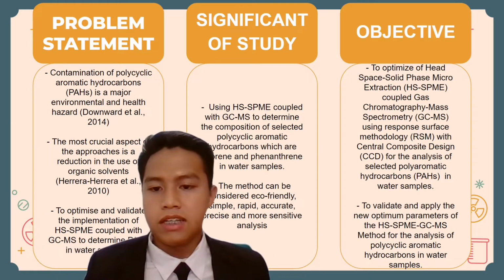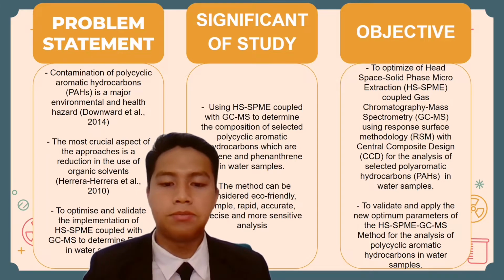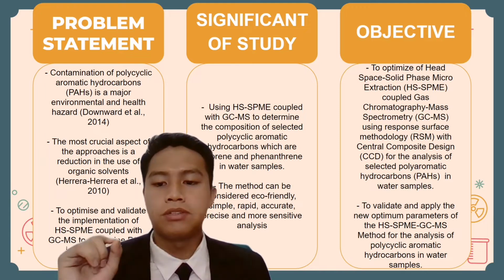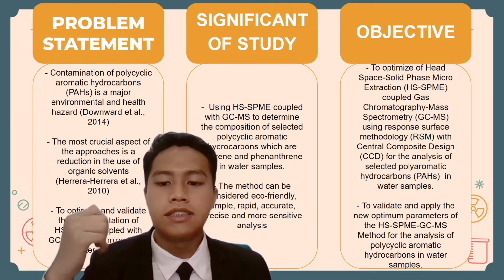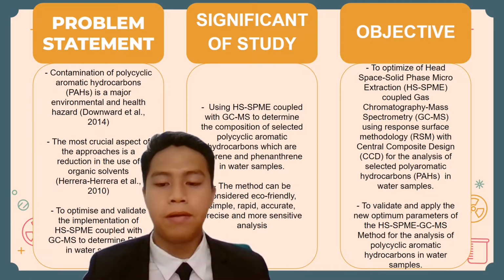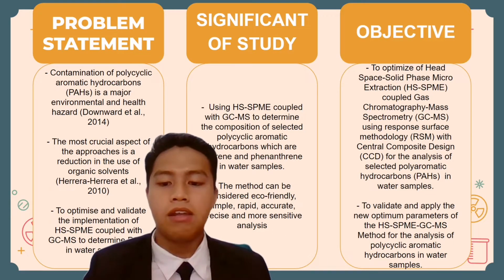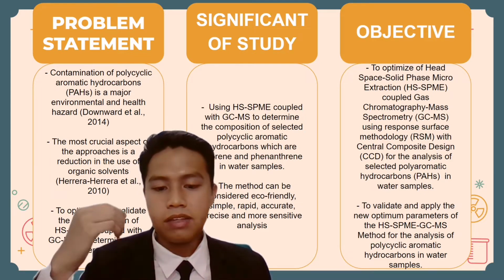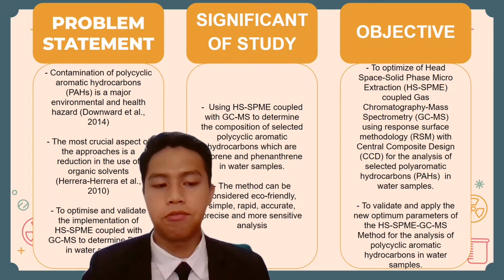The objective of the study is to optimize the HS-SPME coupled with GC-MS using RSM, response surface methodology, and CCD, central composite design, for the analysis of selected PAH in water samples, and also to validate the optimized condition using other samples such as drinking water.